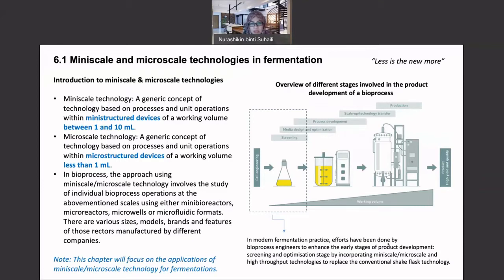Having said that this technology is a generic concept of technology, it doesn't mean that it is only applicable to fermentation. It's not only applicable for bioprocess, but it is actually applicable in a wide variety of fields. And even if you talk about bioprocess, it is a huge field. It's not just fermentation. Fermentation is only part of bioprocess, where fermentation is situated under upstream process. Under bioprocess, there is also another field called downstream processing, which concerns with the separation and purification of the product after the production through microbial or plant or animal fermentation. Okay, right.